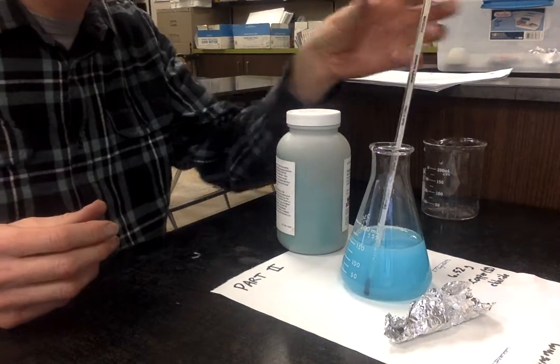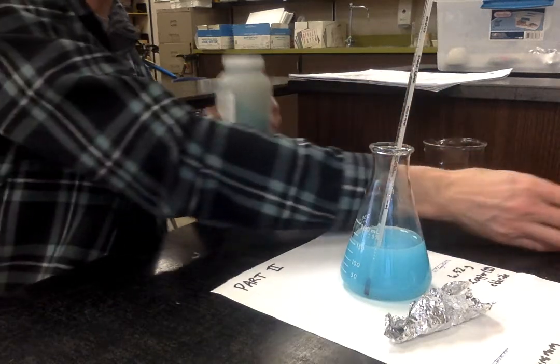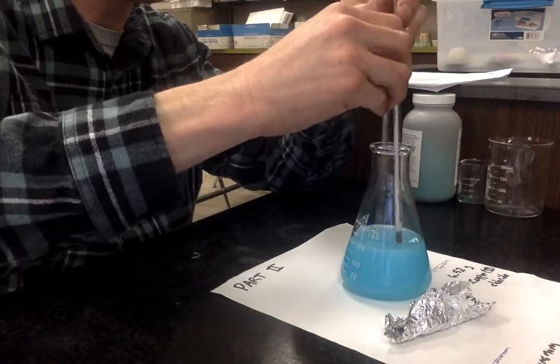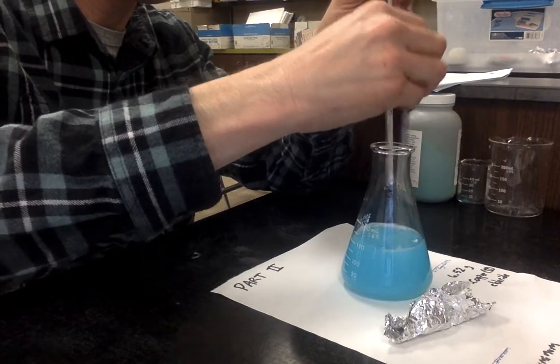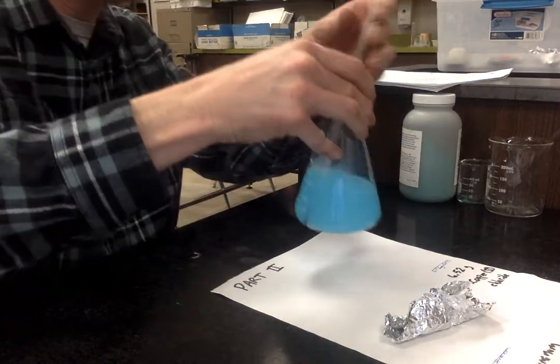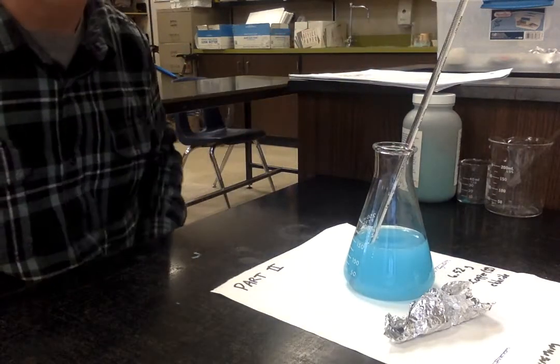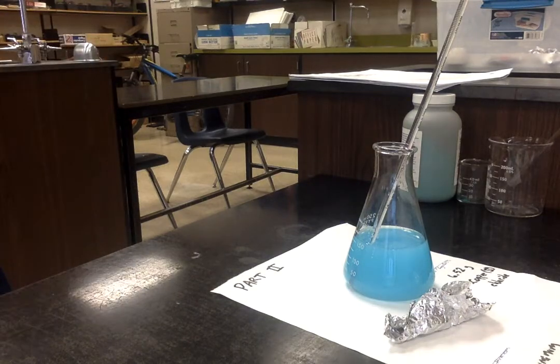Now I'm putting this thermometer in. We will get the temperature before the reaction. I'm going to get some stuff out of the way. Let's try and stir this a little bit here. There. So a slightly cloudy solution. That suggests that maybe not all the copper chloride is dissolving. Let's go back to these reactions here.